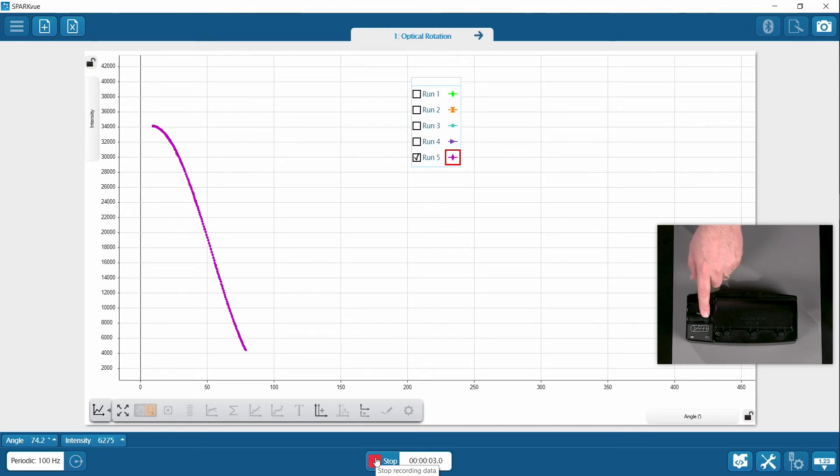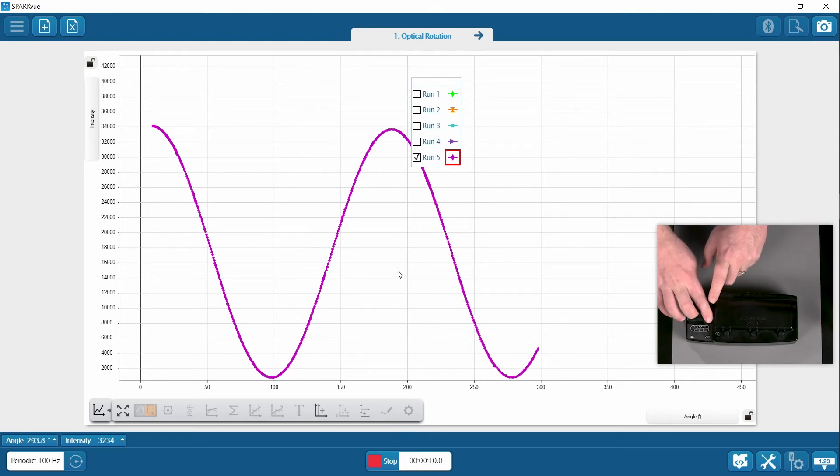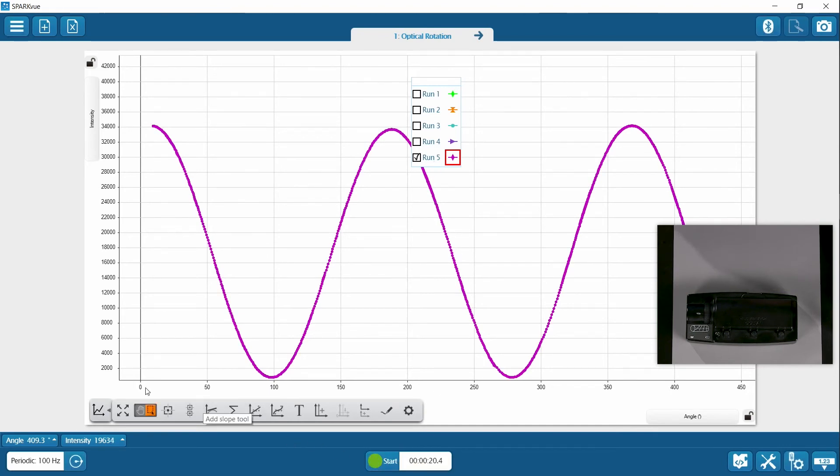Again, I'm going to use this second—it looks like the second wave, but it's really the first full wave. That's why we're using that one, because if it shifts, you never know on those ones that are close. I don't use this one because it may shift to the left, and then you can't use it in the second or third run. But let's use that one to find out your unknown. I'm going to find the center of that distribution.